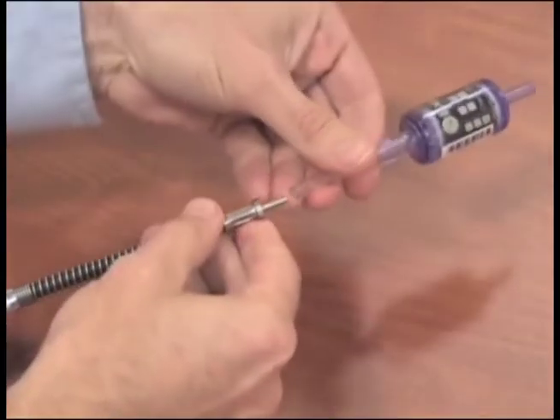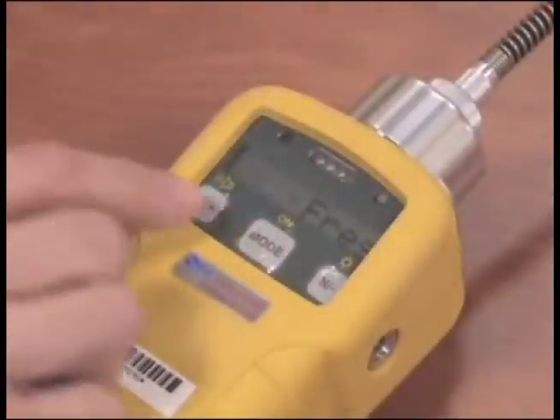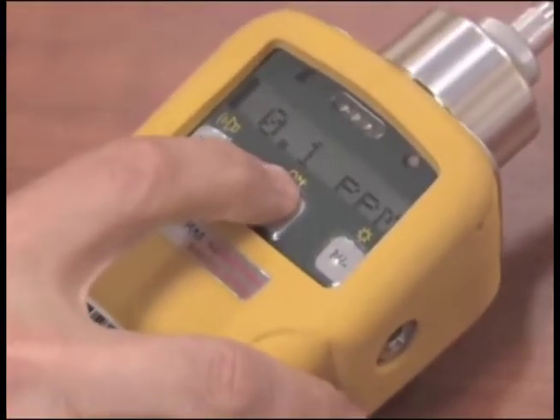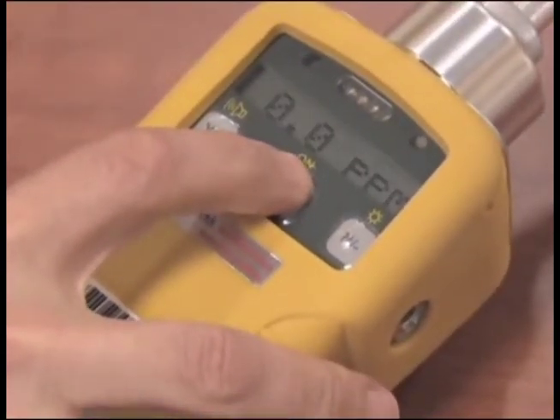Attach the zero carbon filter with the arrow pointing towards the unit and press Y. The unit is now re-zeroing. When re-zeroing is complete, the screen will display Reading 0.0. Push the Mode button until the unit shows the flashing L, indicating the unit is collecting data and data logging the results.